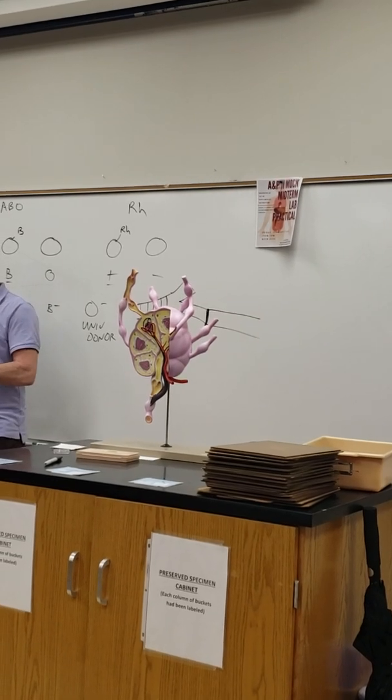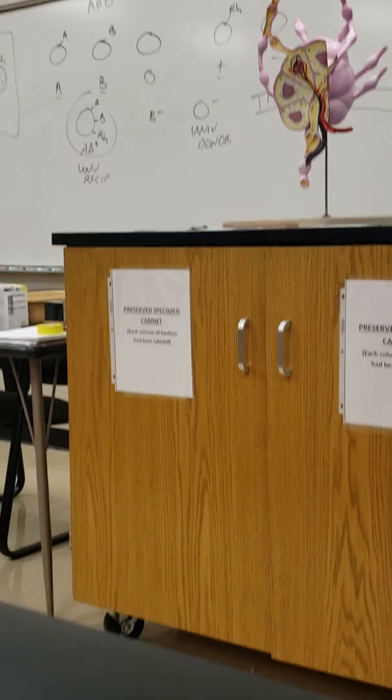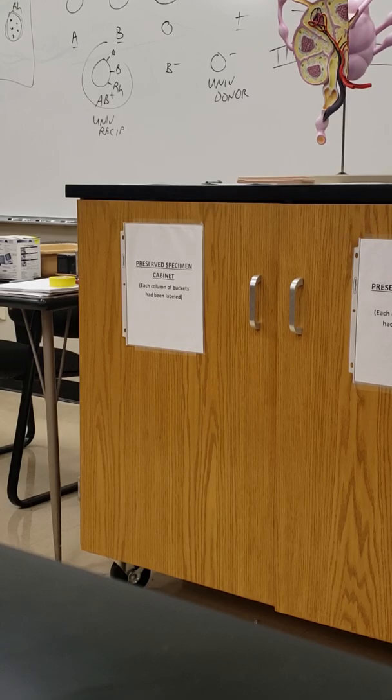Now, as for the heart itself, gotta make my way. Don't worry, you don't have to film me. I'm going to go back to the front. No? Somebody tried to make a baby heart out of 2 fronts. This will work out. We can Frankenstein this one together. All right, this is fine.